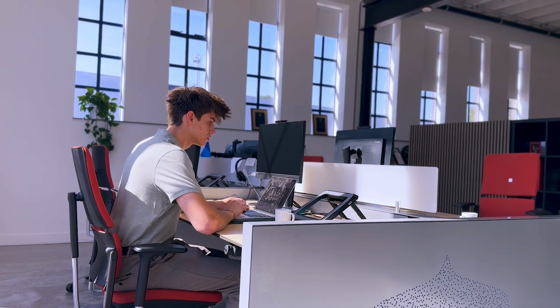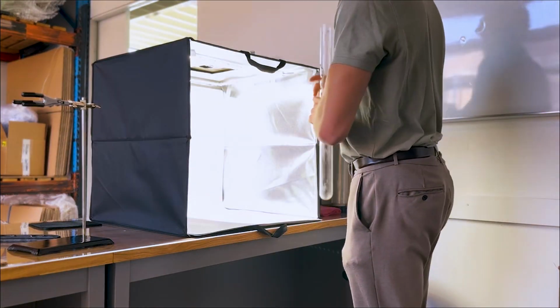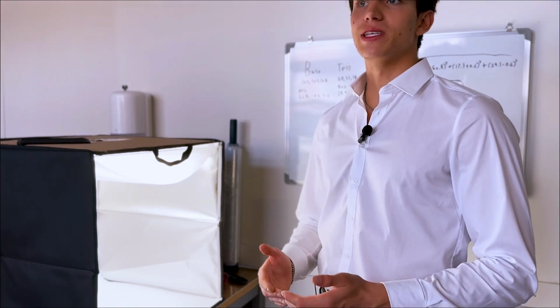Which is why this summer I've set out to create an objective metric via standardized procedure to determine the condition of this glassware. Let me walk you through it. Now, the first thing I wanted to prioritize with this procedure was making sure that every single time we went to analyze a piece of glassware, it was exactly the same as the last time.